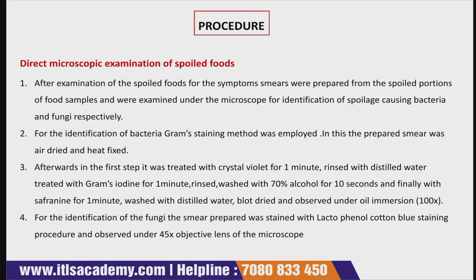So you take a sample of the spoiled product, and after taking the sample, you make a smear out of that spoiled portion of the food, or you can say of the fruits and vegetables.